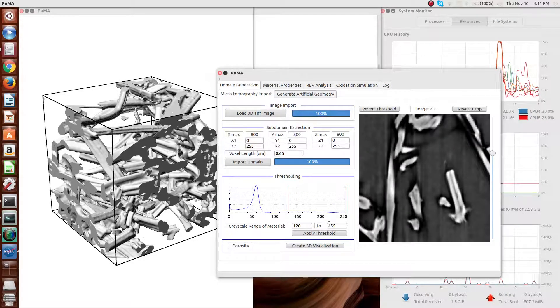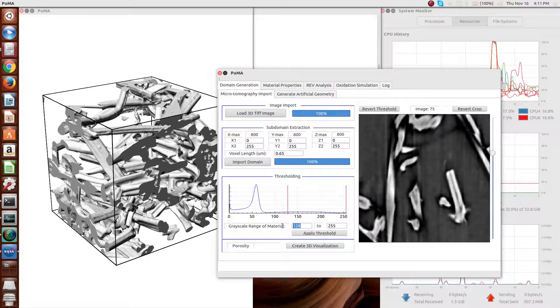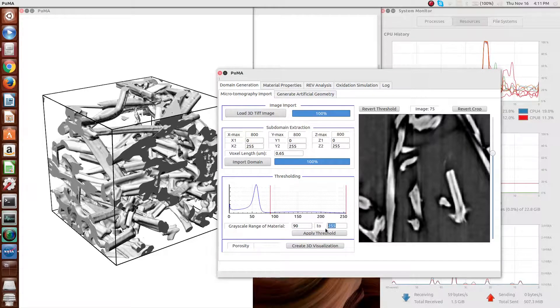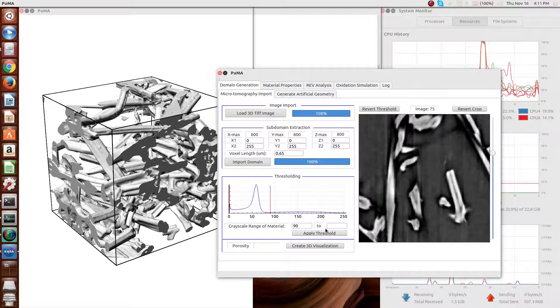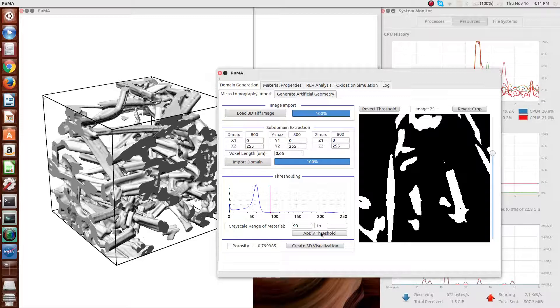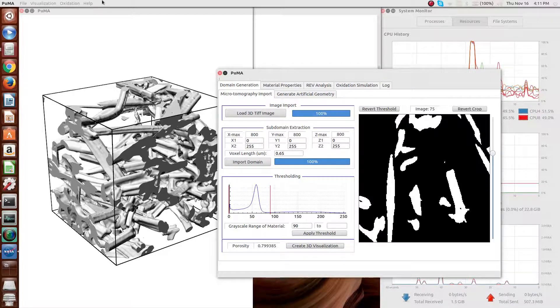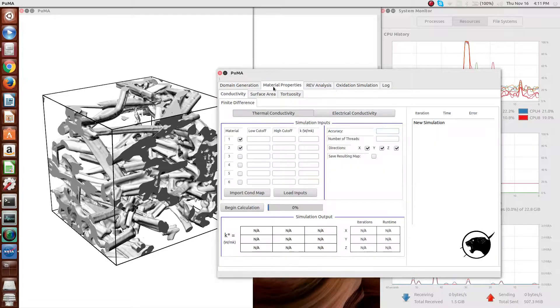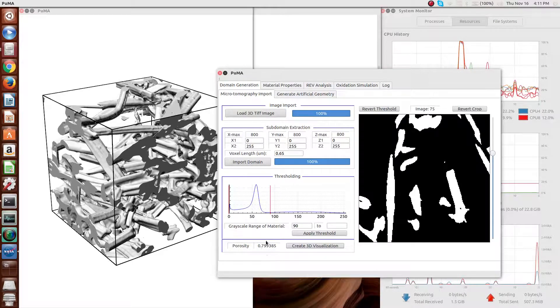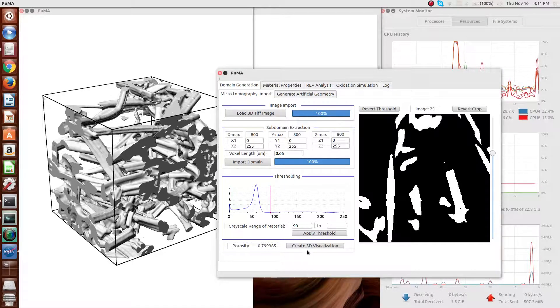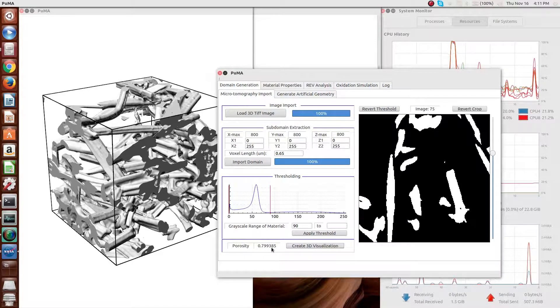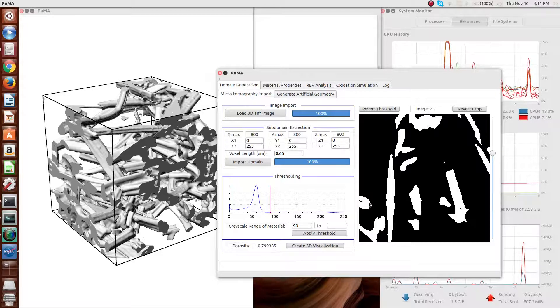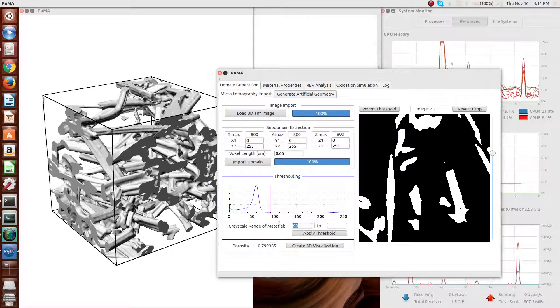But for the rest, we're going to go back to the microtomography sample that I started with. I'm now going to move on to the material properties aspect of the code. The first material property is the porosity, which you can see there at the bottom, which is simply a result of the thresholding that's selected.